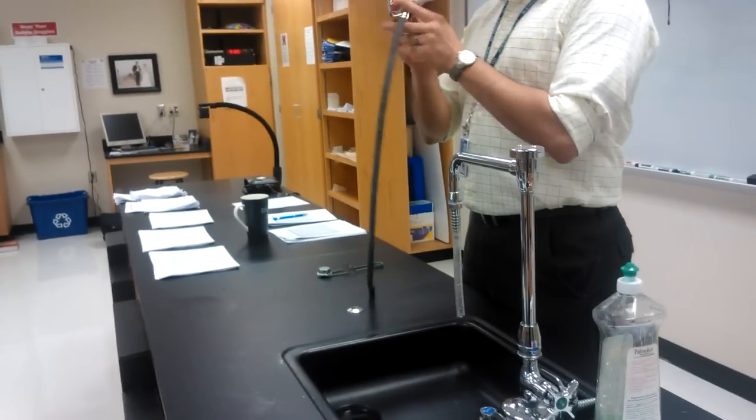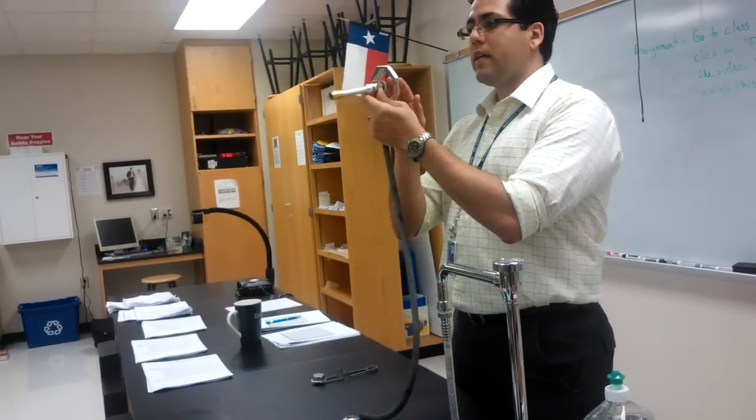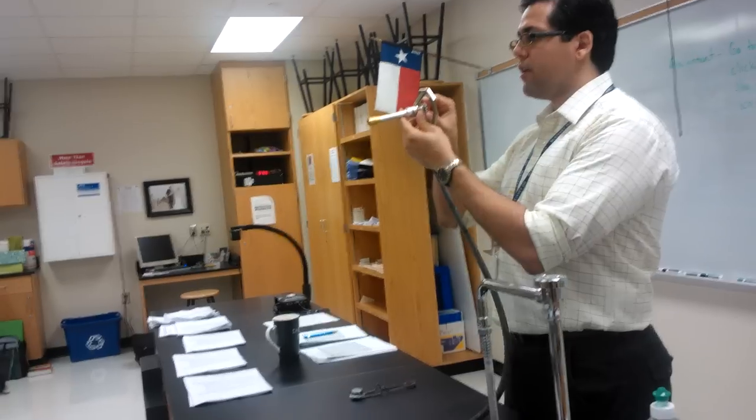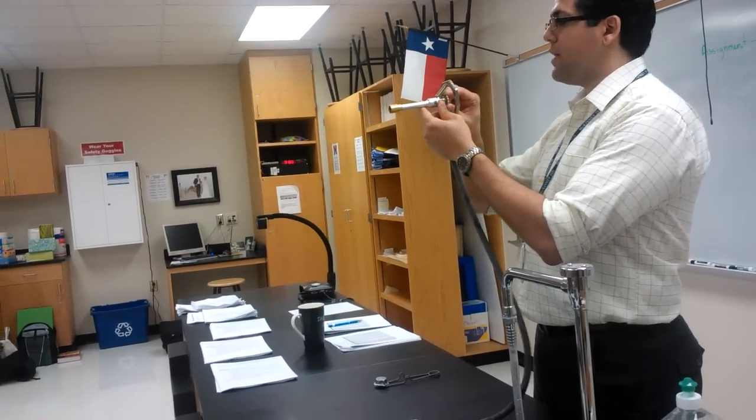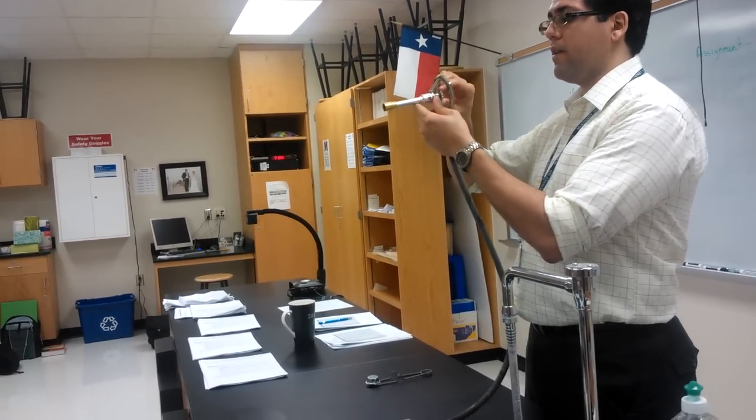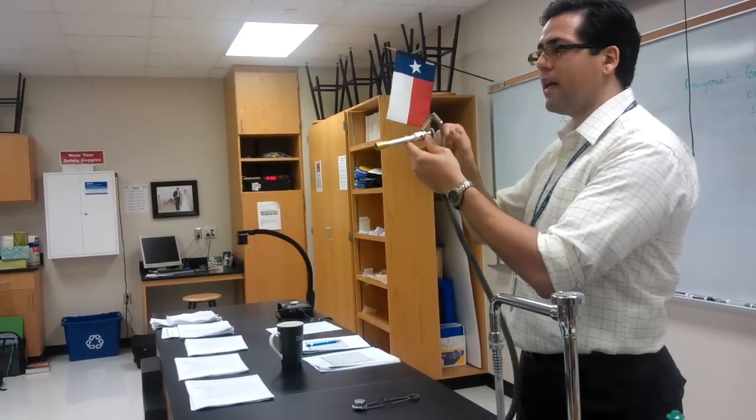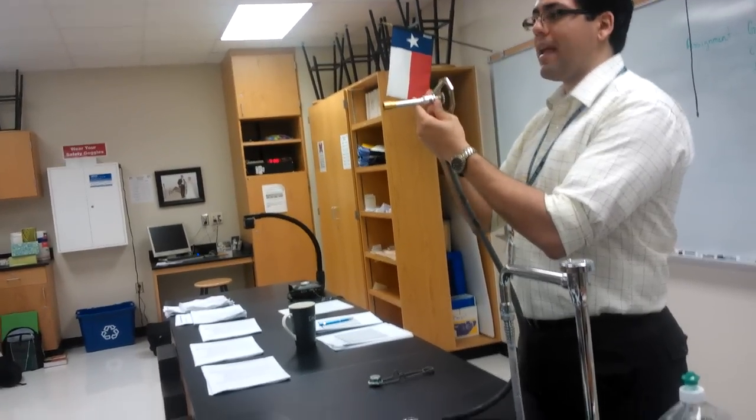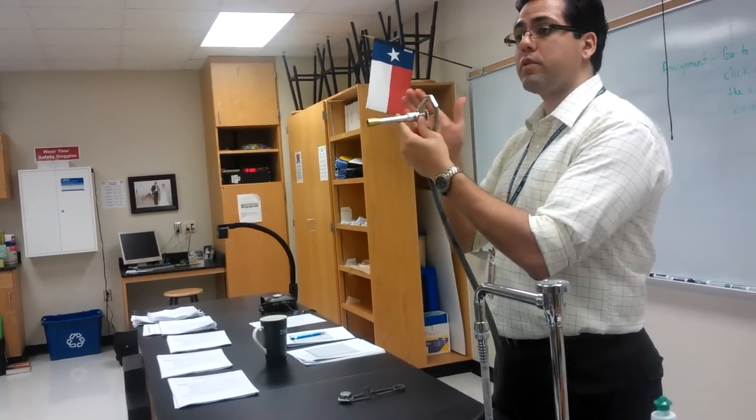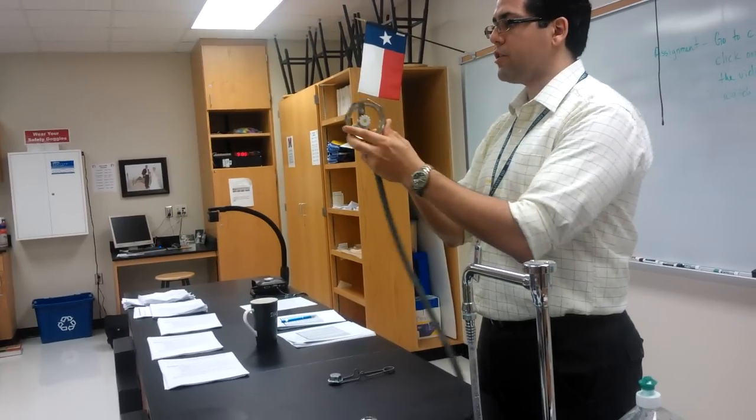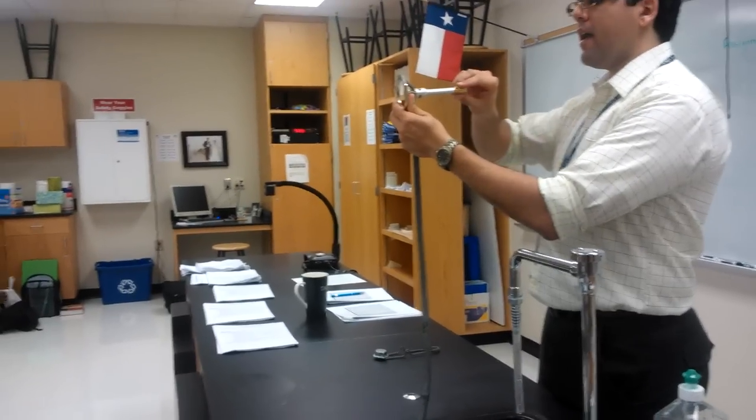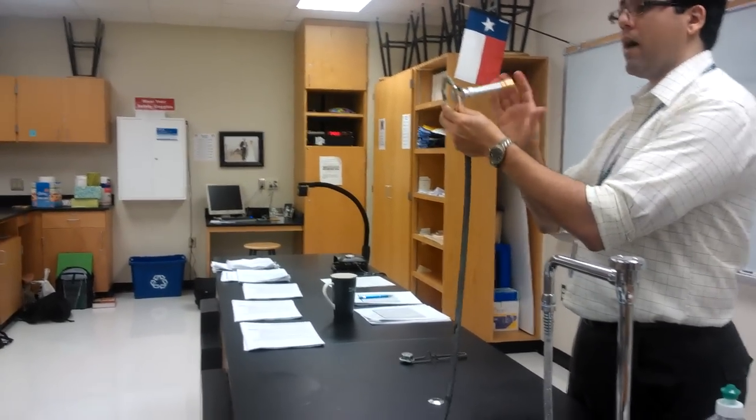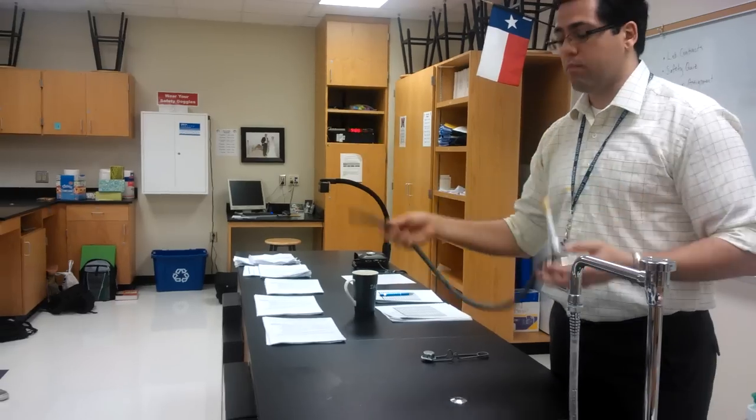Next, take your Bunsen burner. Point it at you, the bottom. You see the knob down here - turn it clockwise to make sure it's shut, just until you feel it hit. That's going to close the gas. I always want to start with a closed Bunsen burner. Then turn it around so the barrel is facing me and also turn it clockwise until it hits. Now I'm ready to connect my Bunsen burner.